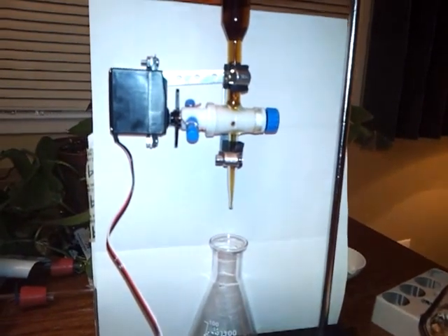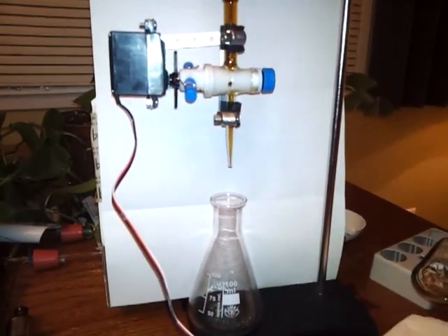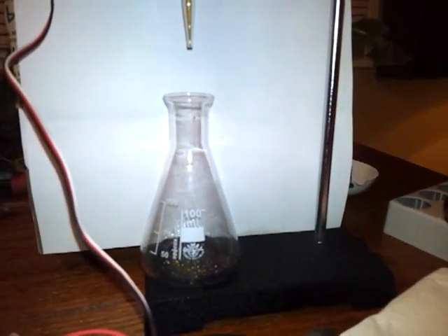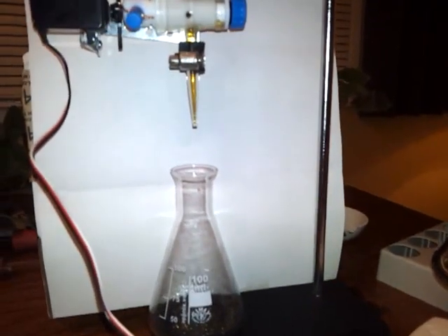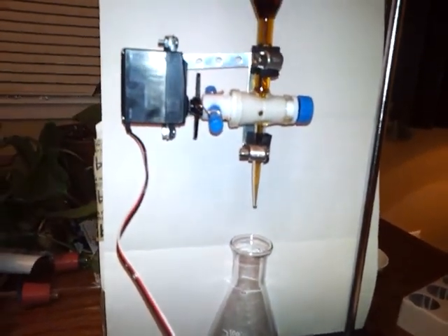Running the program spins the stopcock and makes a small amount of liquid go into the beaker. It looks like it's doing about two-tenths of a milliliter with each go.